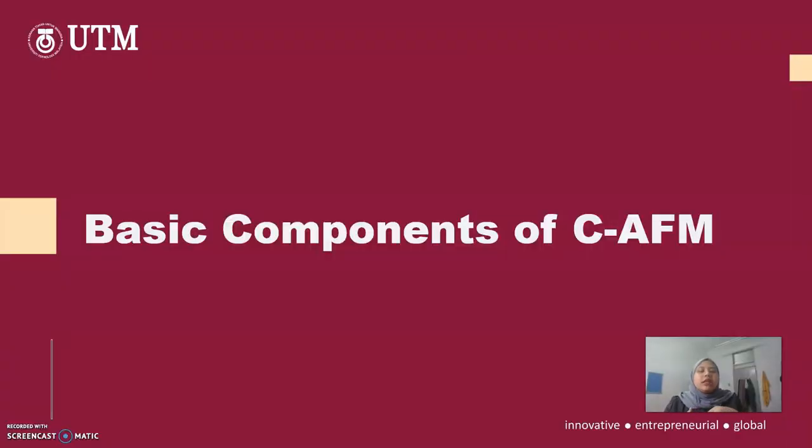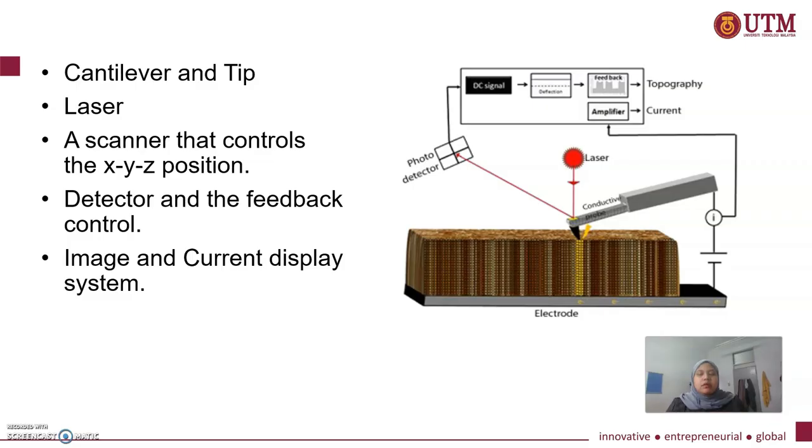We move to the next slide, basic component of CAFM. CAFM consists of cantilever and tip, laser, a scanner that controls the XYZ position, detector and the feedback control, and also image and current display system.